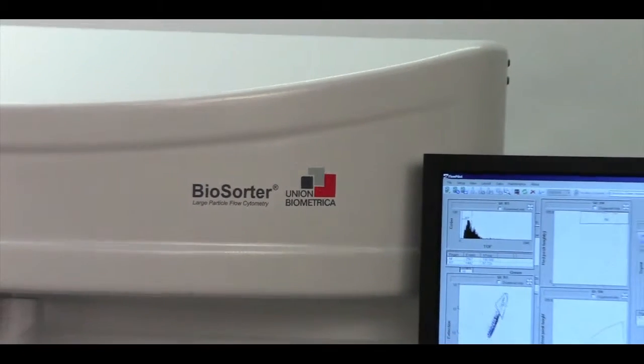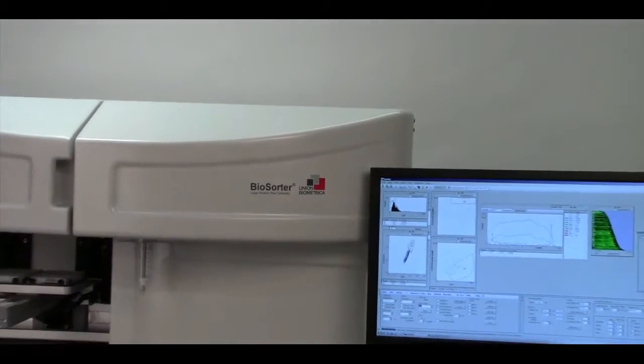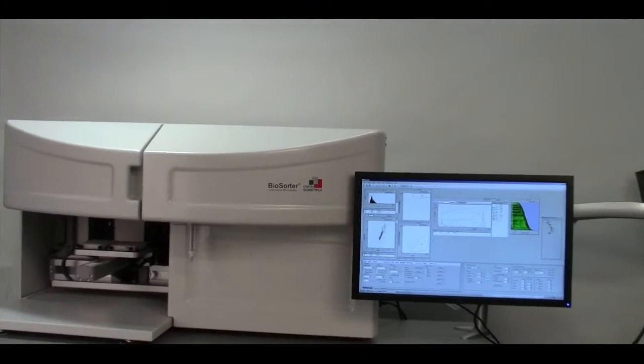Union Biometrica's Biosorter instrument is designed to be a flexible platform for the analysis and sorting of objects in the 10 to 1500 micron size range.